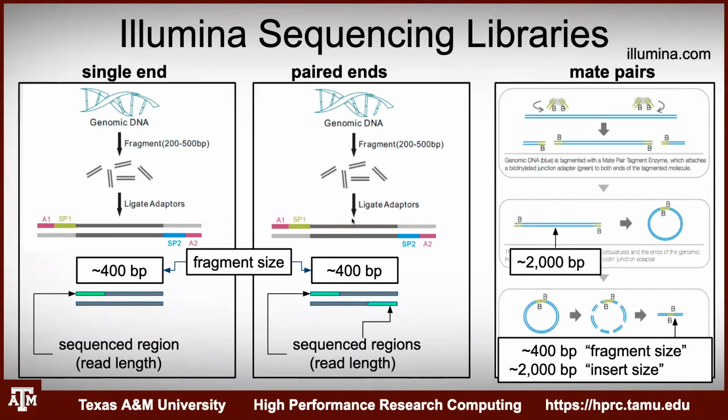which is the most common whenever you're dealing with either genomic data or full mRNA data, you'll use paired end. Single end is cheaper, but it's also used for things like small RNA, where having two reads that completely overlap doesn't really help you, right? So when you're really just interested in nucleotide fragments or RNA fragments that are smaller than 50 base pairs, a single end run is perfect for that.